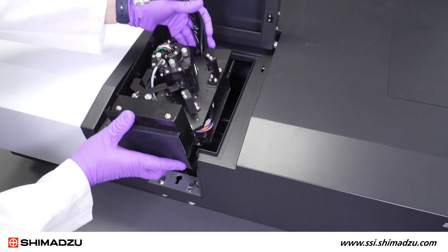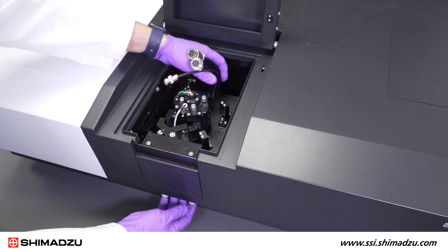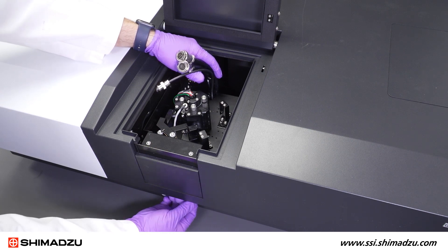The integrating sphere will slide into the alignment pin in the back of the sample compartment and sit down into the front. Make sure to secure the locking screws in the front of the sample compartment.